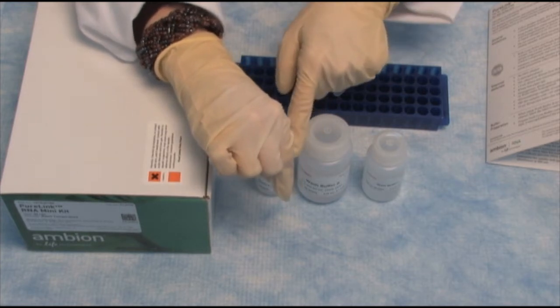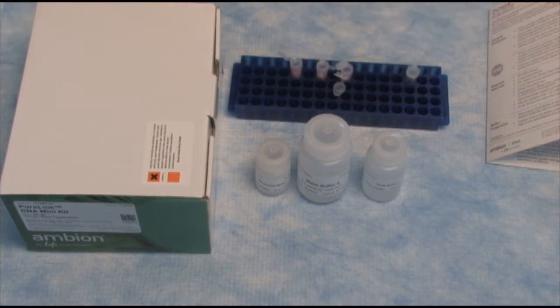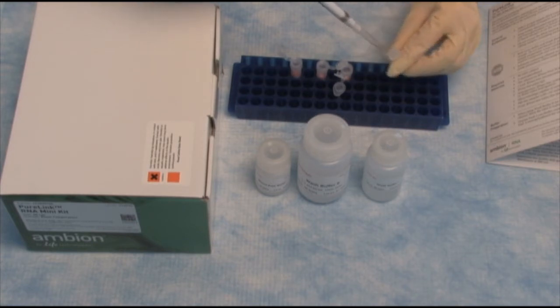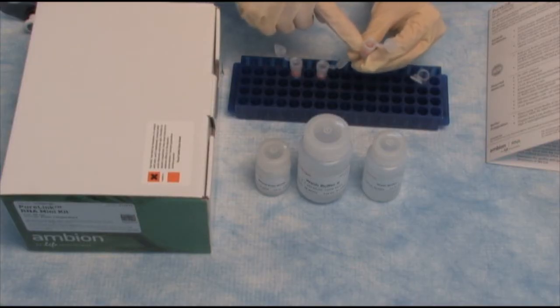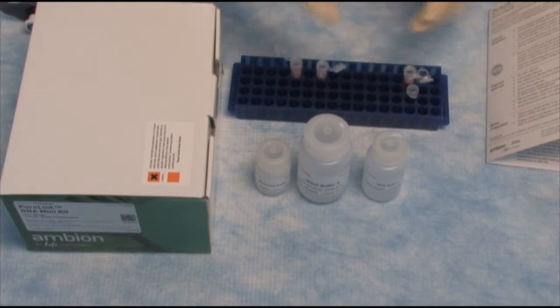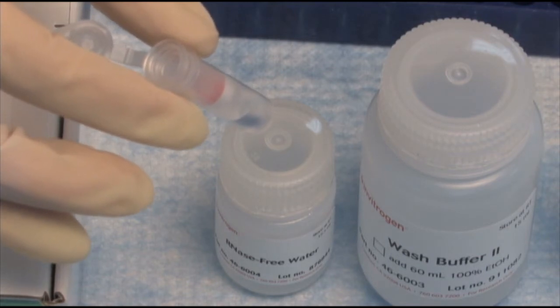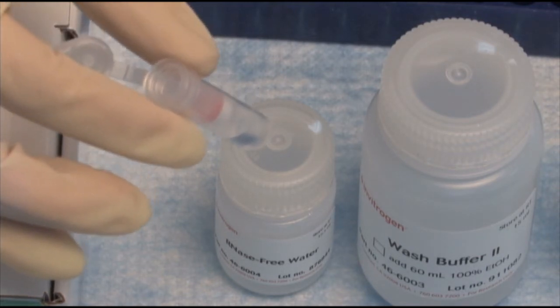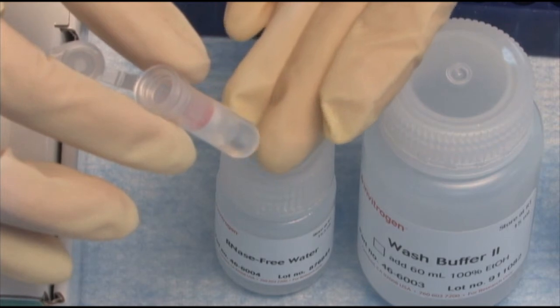The way that this workflow works is we will first take our sample, which has been lysed and homogenized, and we will add it to a collection tube. We will pipette that into the top, and now the RNA will bind to the spin column. We will centrifuge and wash this several times. I happen to have a tube here that's already been centrifuged. So once we've added the cell lysate to the collection tube, the RNA will bind to the spin column and we will centrifuge such that the liquid comes down into the collection tube, as you see here.